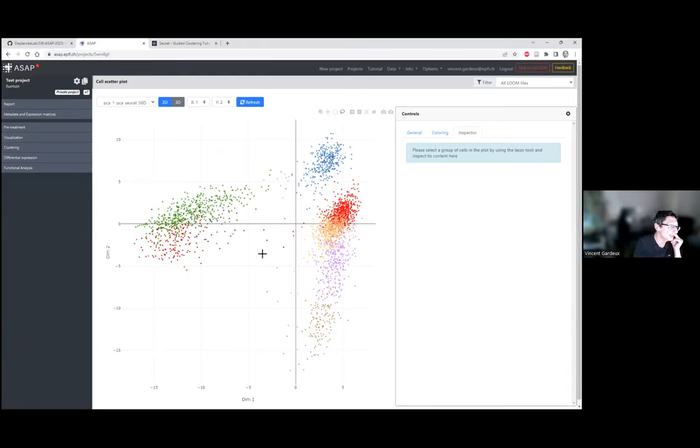So in the case of disease versus control, if you create this metadata annotating which cells are disease and which cells are control, then you can add it, and afterwards you will be able to visualize it. You will also be able to do differential expression between the two conditions, or anything else you want to do, since it will be included, so you will be able to run it.